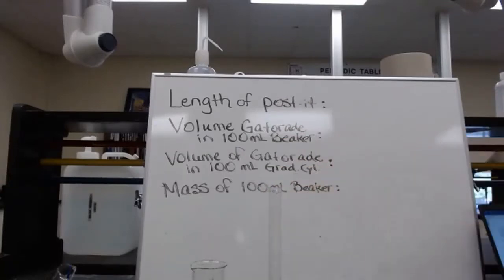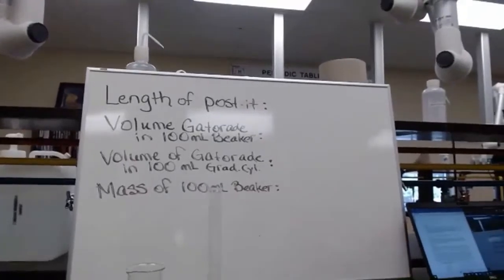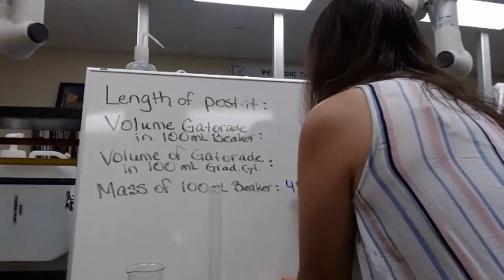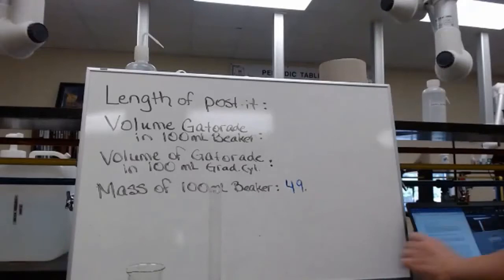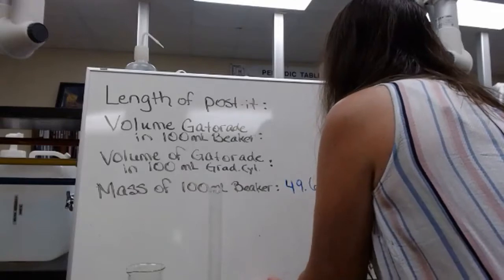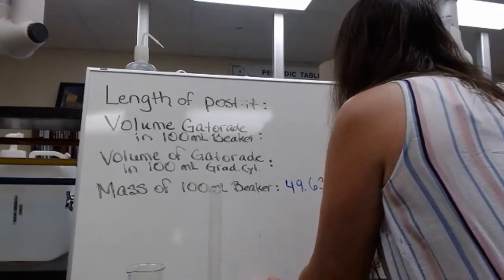So in the space beside of it, I'm going to write down 49.636 grams.